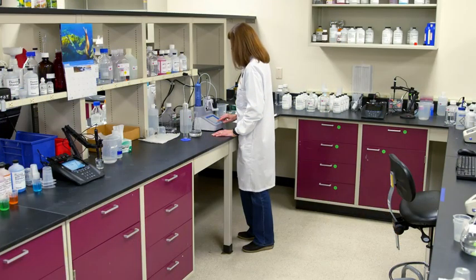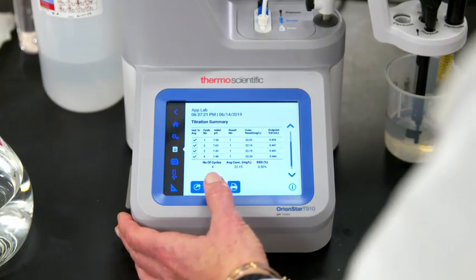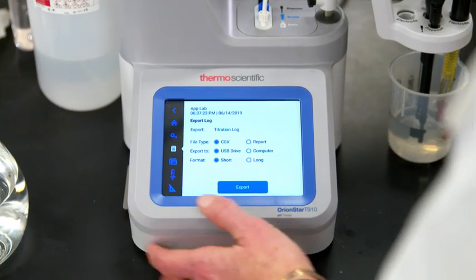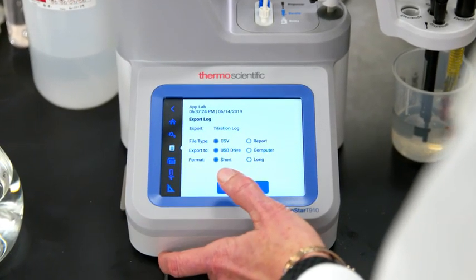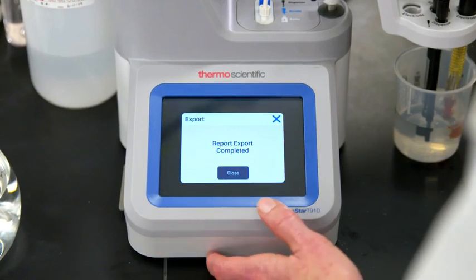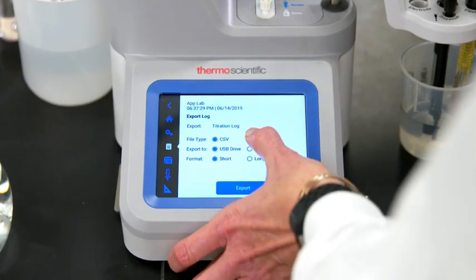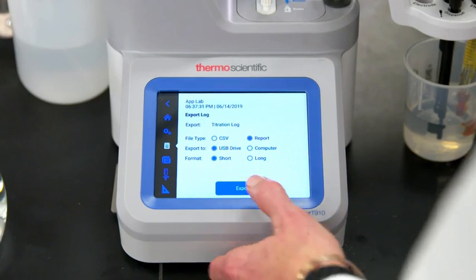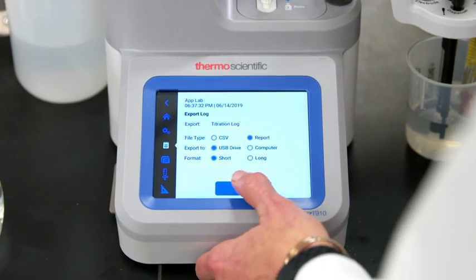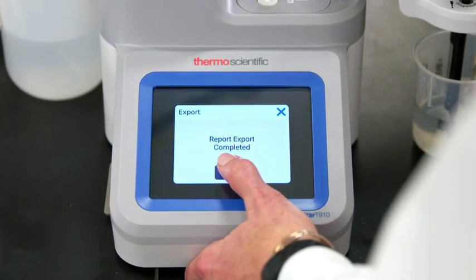When the titration is complete, I have a choice of how I want to review my data. I can print a report, export a PDF file, or export a CSV file. My titrator saves the most recent 100 titration results, so I don't have to worry about losing my data.